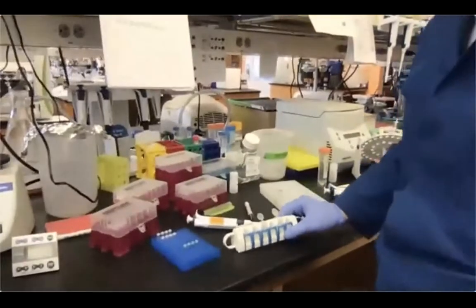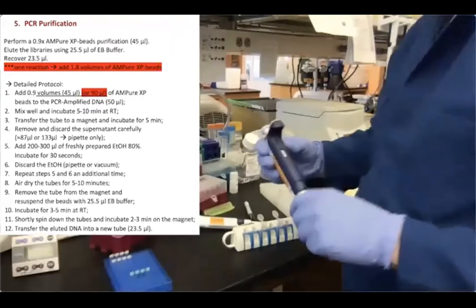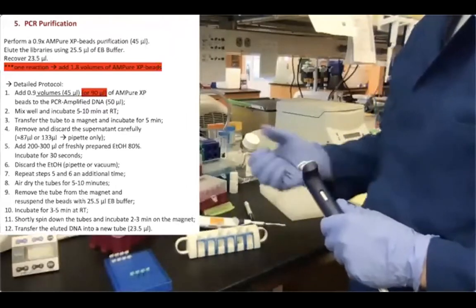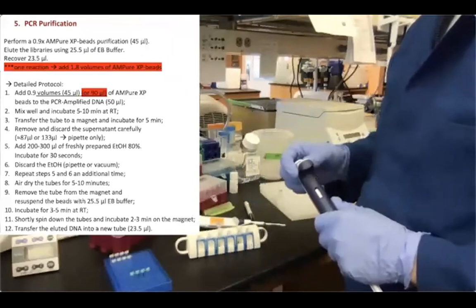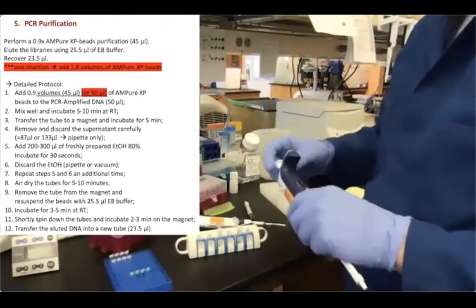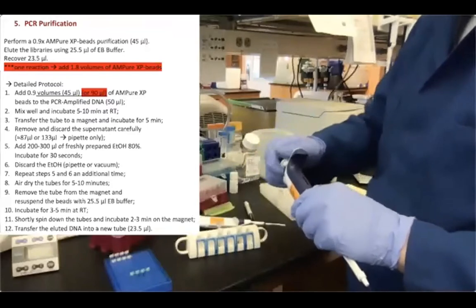The first removal of the supernatant, again, I just wanna remind you, you may wanna do it with a pipette and not to basically retain beads. So the beads now have bound the DNA of your interest, okay? So you don't wanna discard the beads with DNA that you wanna purify.